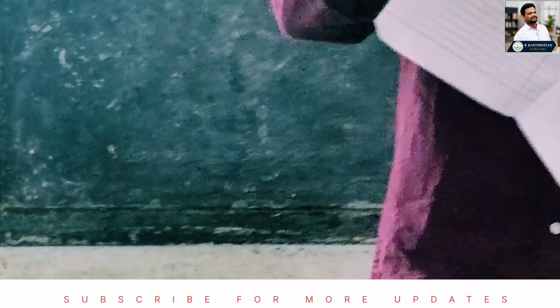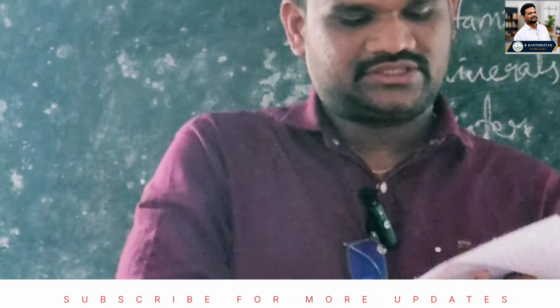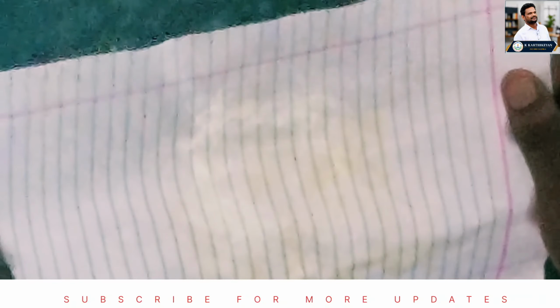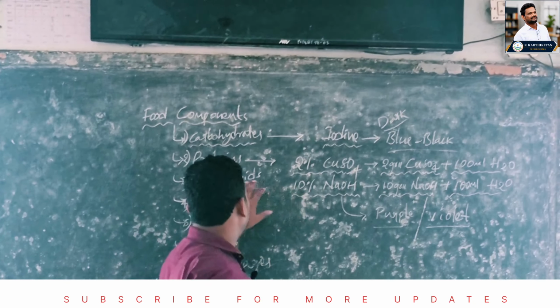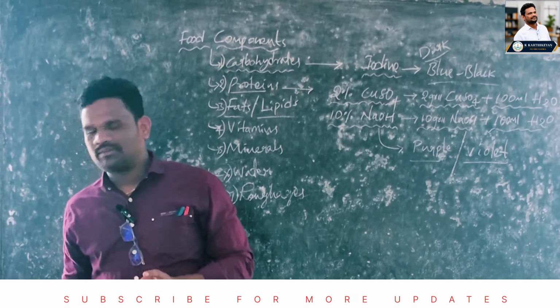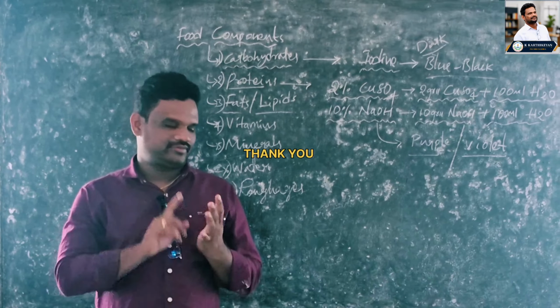Now let us see. This paper turns translucent. Okay, translucent. Are you able to see the translucent paper? Like this, the paper turns translucent. Okay, now this experiment confirms that the egg yolk contains fat or lipids. Okay, now these are the confirmation tests for food components. What are the components? Carbohydrates, proteins and fats. Okay?